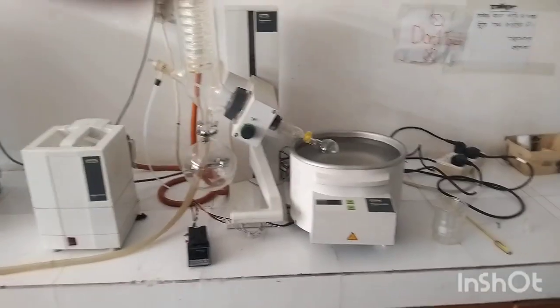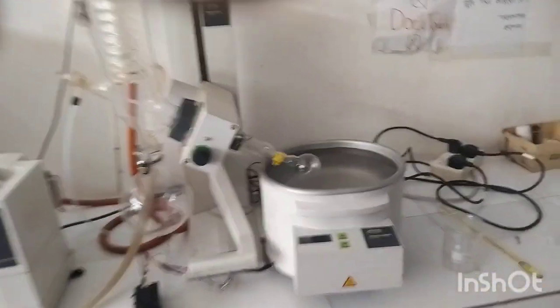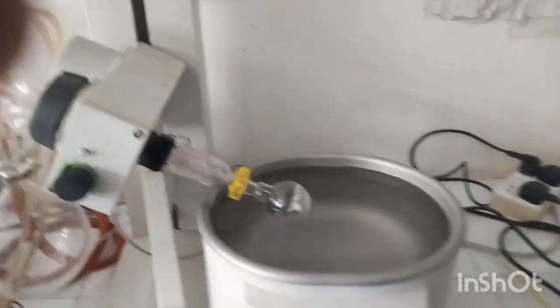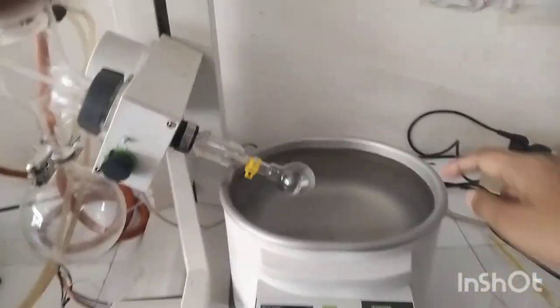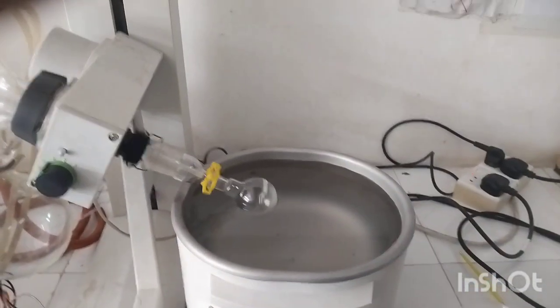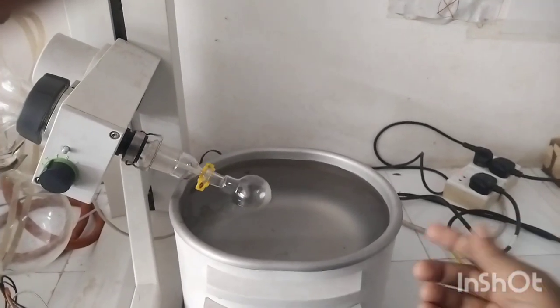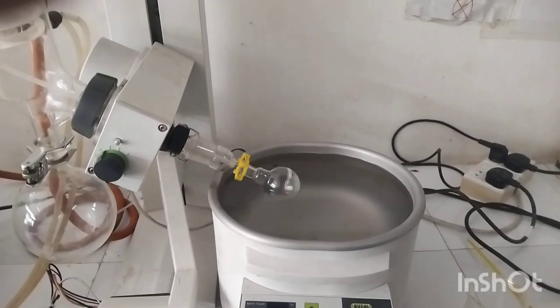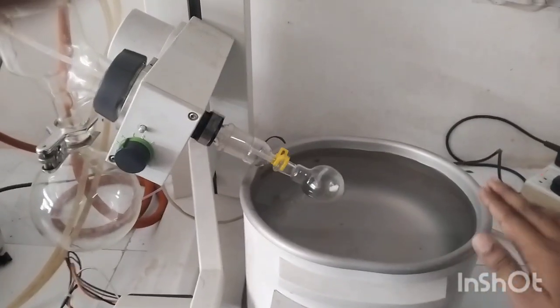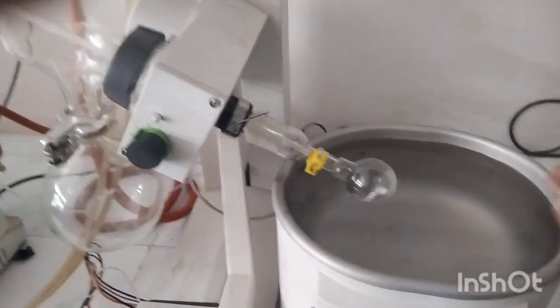So guys, another thing is the portion of the heating bath. If you'd like to increase the temperature of the water, you have to keep in your mind that in this specific heating bath you have to use distilled water, because when you use normal water, it can cause corrosion of this specific steel. So we have to use distilled water, and we have to keep the volume of water approximately at the upper portion of this specific heating bath.